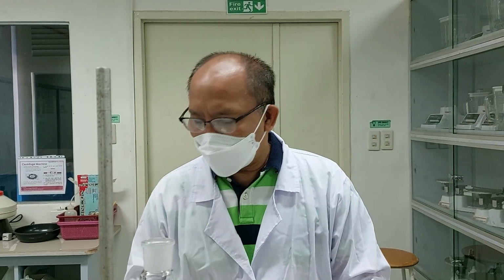How are these classes differentiated from other classes of organic compounds like aromatic, alkyl halides, etc.? So for the first experiment, first we have to generate the unsaturated hydrocarbon.